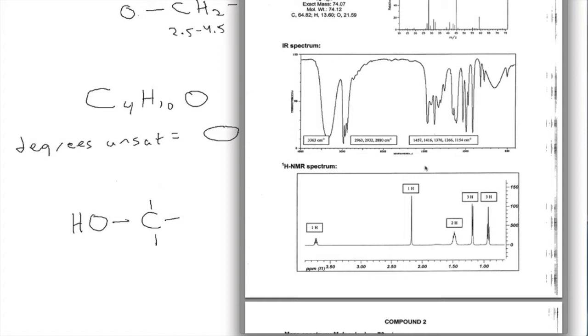Would it be the doublet or the... It'd have to be another singlet because it's not getting split. There aren't any other singlets. Now we don't know whether it's a singlet or a doublet because we don't know what other hydrogens there might be next to that carbon. Right. Oh right. So let me give you some help.